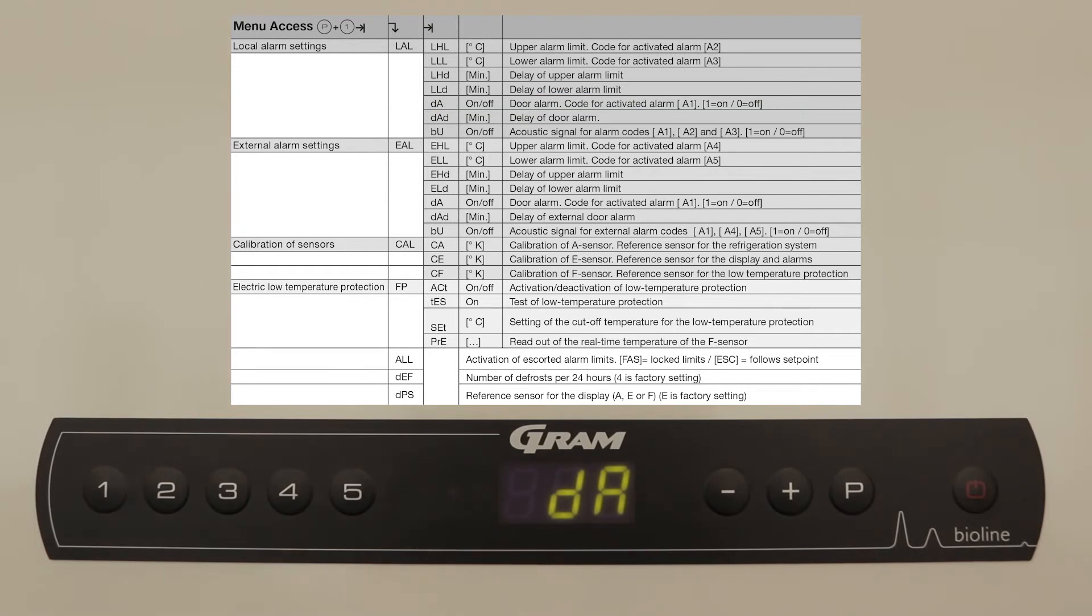We will now set the delay of the door alarm. This is in increments of 1 minute. We will set this to 1.